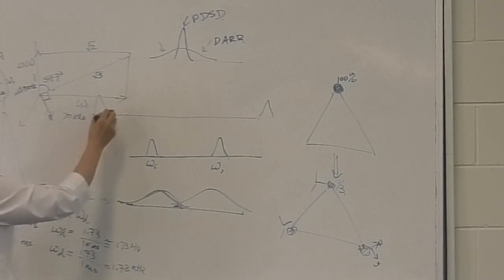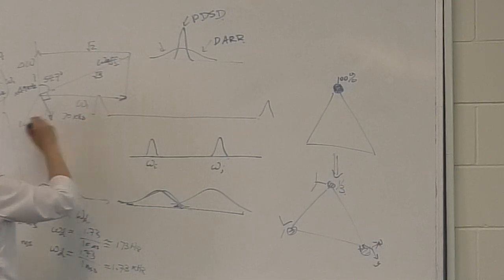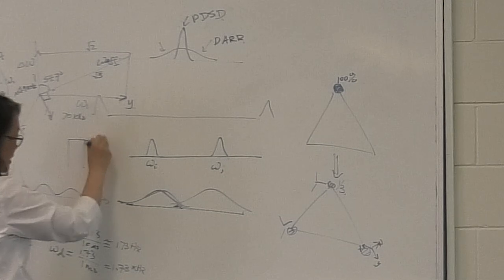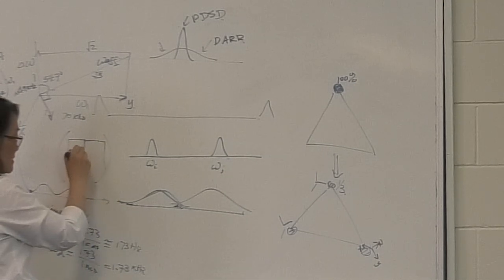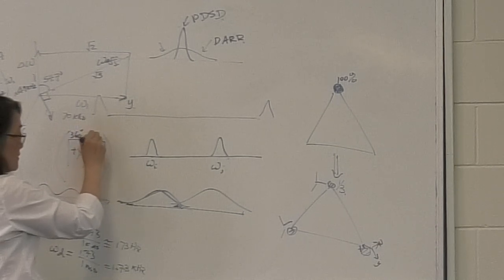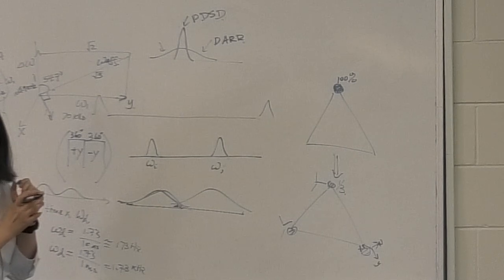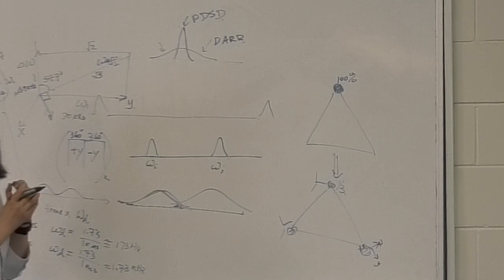So when we do frequency switch Goldberg, the effective field is very important to think about. Suppose this is the x-axis, this is the y-axis. The basic module of frequency switch Goldberg is plus minus, let's say plus y minus y. This is a 360-degree rotation, a 360-degree rotation, but all in the tilted effective field sense. And that's your basic element of FSLG.